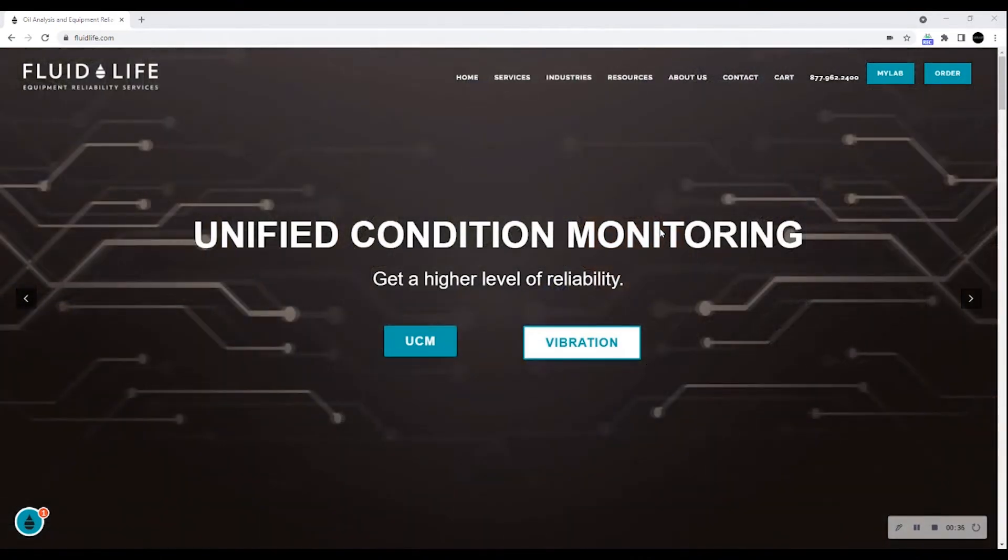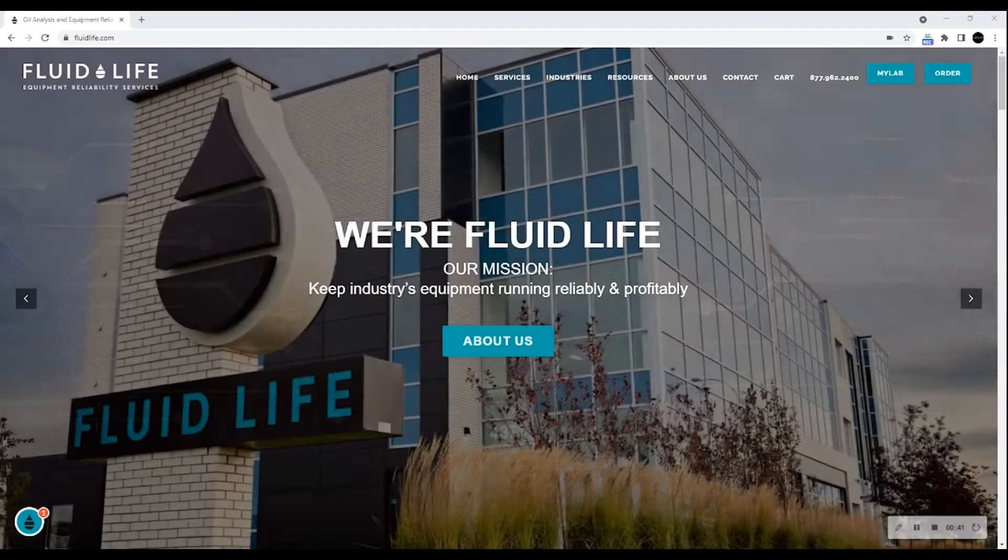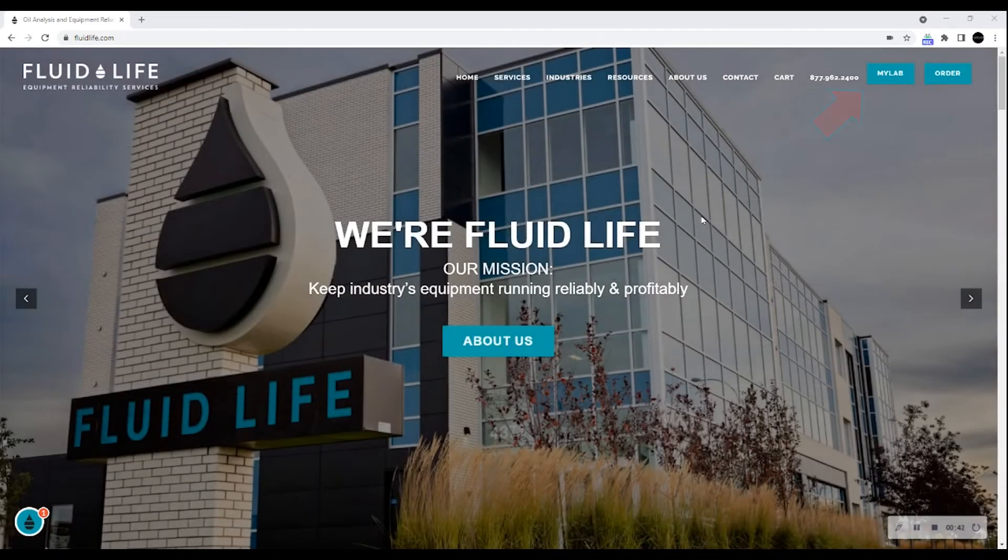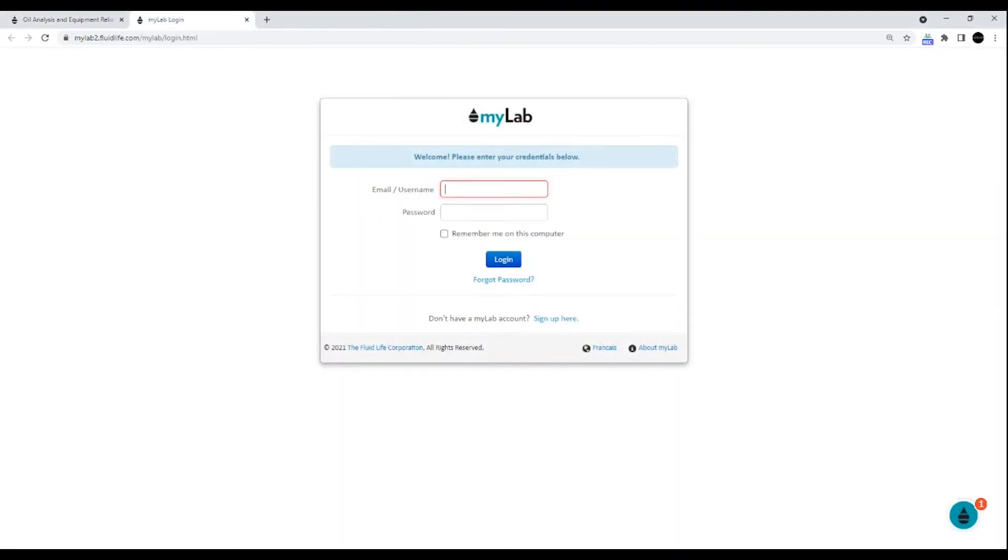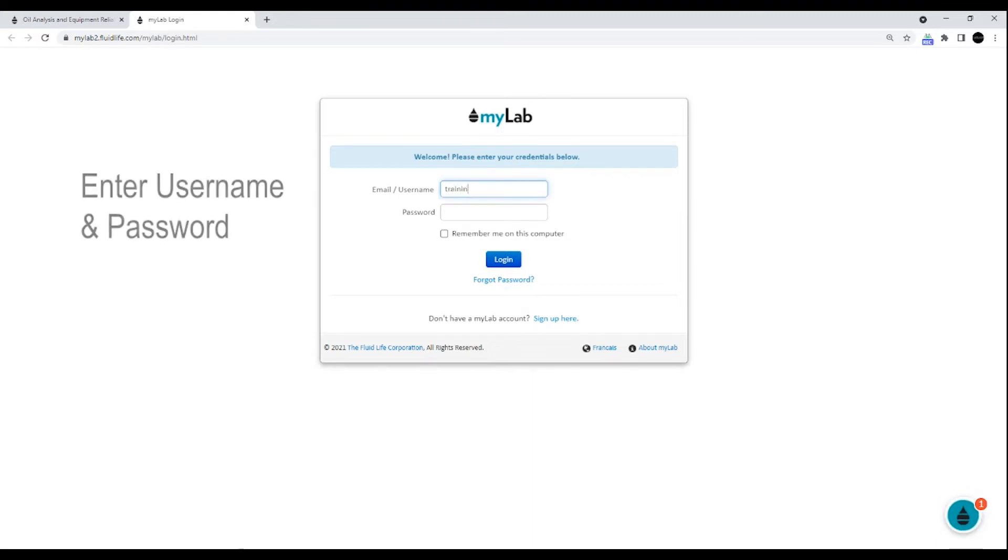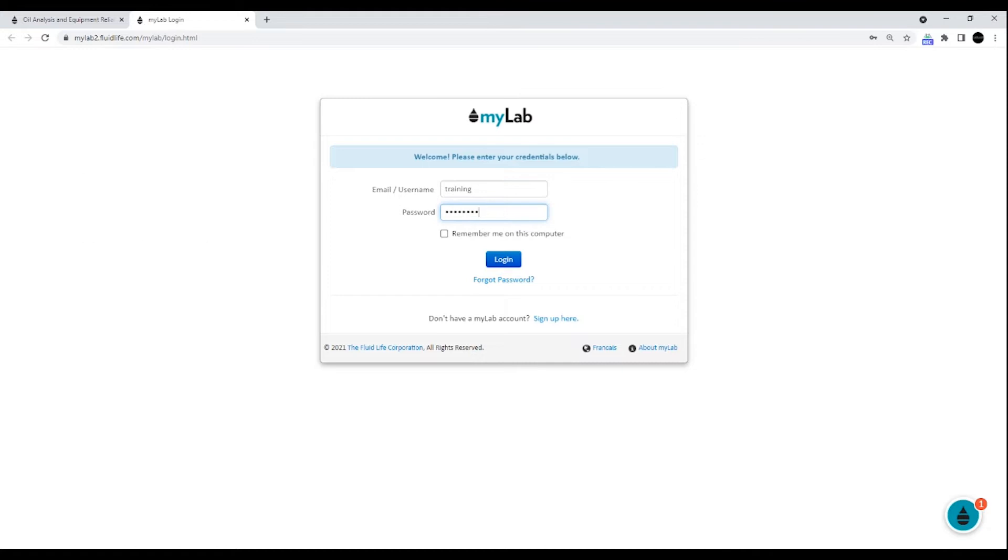To log into MyLab, you can click the link found in the FluidLife website homepage at www.fluidlife.com. Enter your username and password. When you're ready, click the login button.